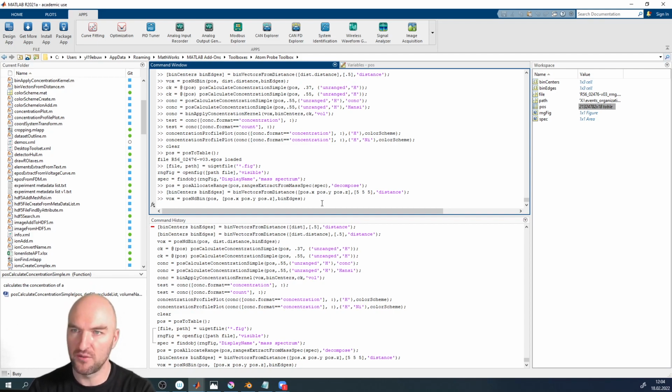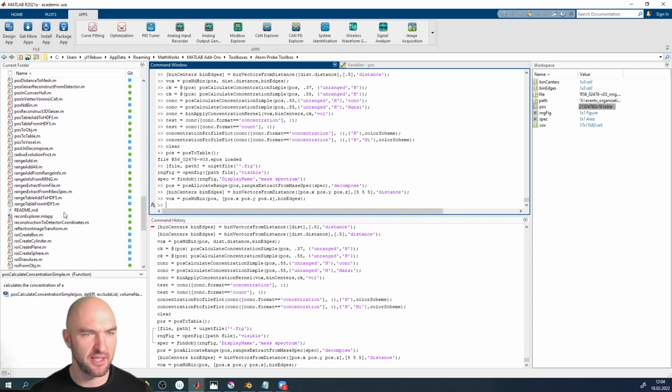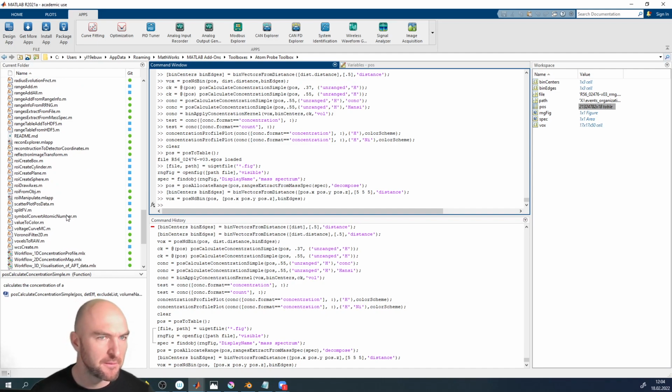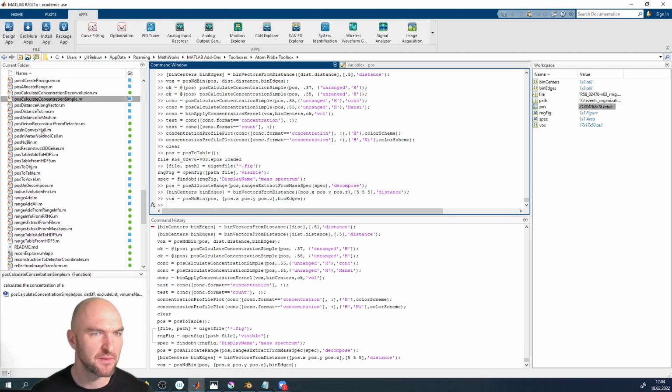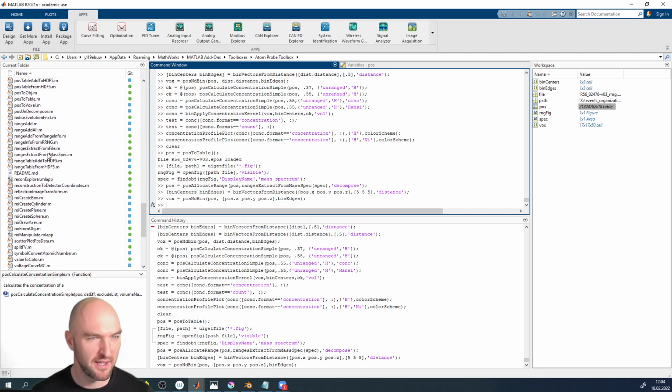That creates a lot of sub-pos variables. I think it might be 10,000 variables, something like that. Well, we can look that up later on. So it might take a second or two. By the way, that was fairly quick. We also have a function called pos to voxel, which essentially takes out individual elements.